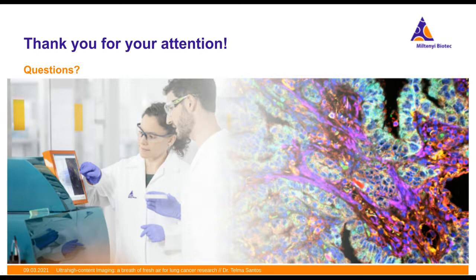And in terms of signal erasure, on one hand, we use photobleaching, and that is why we have the fluorophores that we have. And we can also use another mechanism based on our REAlease technology that we developed at Miltenyi, and this is a controlled fluorochrome release of the antibody. Of the fluorophore, sorry.